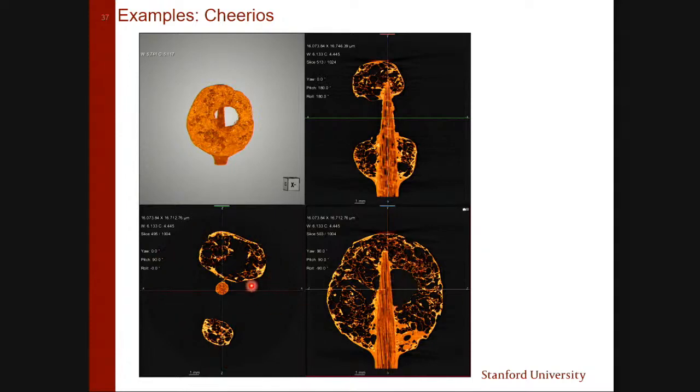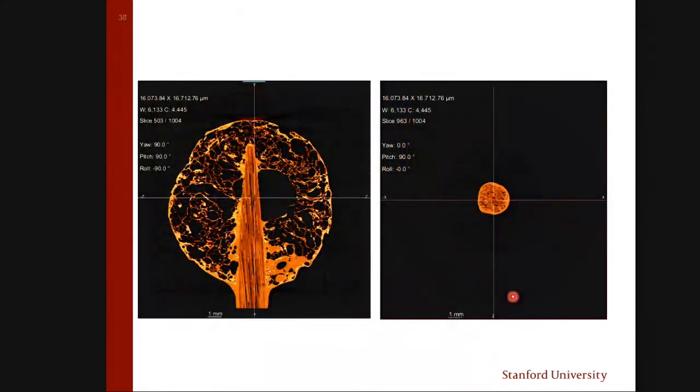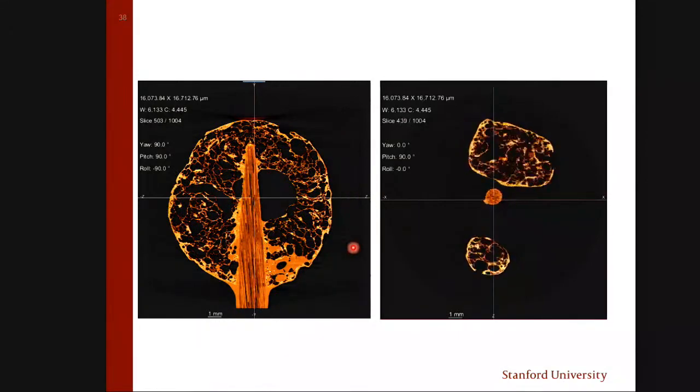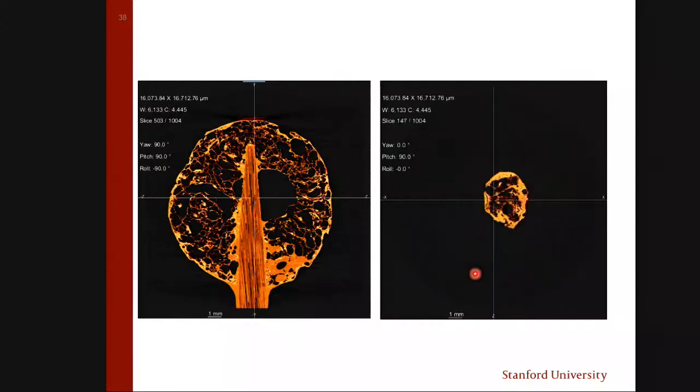Of course, those are also reconstructed, because this particular line will represent this image here. This is the slice. So those three slices. So if I show a movie, it will look like this. We're going from the bottom up. So this green line moving up, and you see different slices here, and you see a toothpick in the middle. So you definitely can investigate the object very nicely.